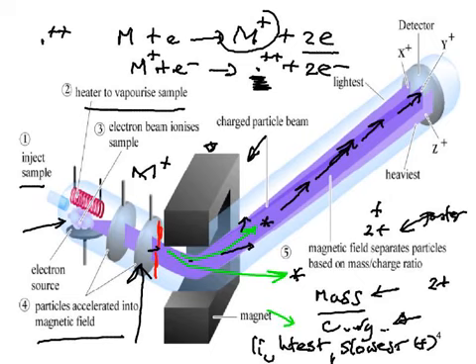So as the magnetic field, for example, would be increased, we would find that something that wasn't deflected enough, we increase the magnetic field, and we find now that it begins to get deflected a bit more, increase it a bit more, and eventually when you increase it just to the right amount, it's going to be deflected by the right amount to head straight up the tube and be detected at the far end.